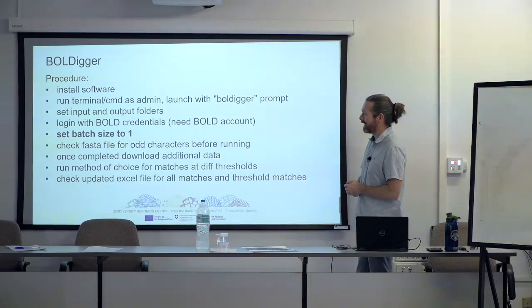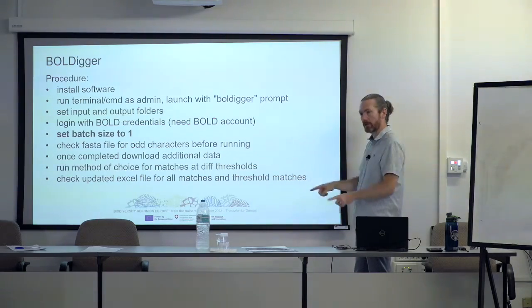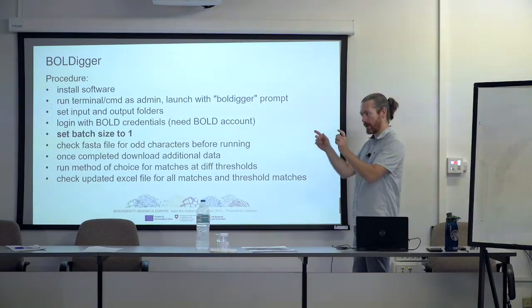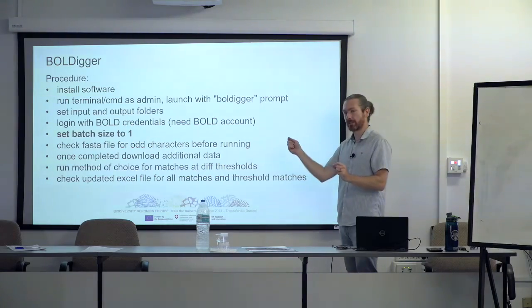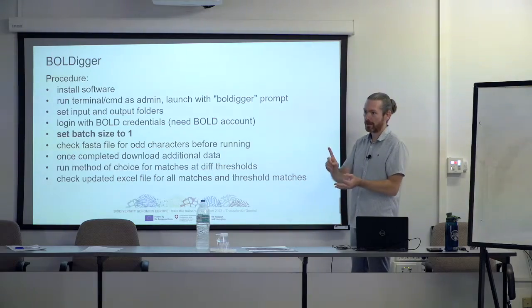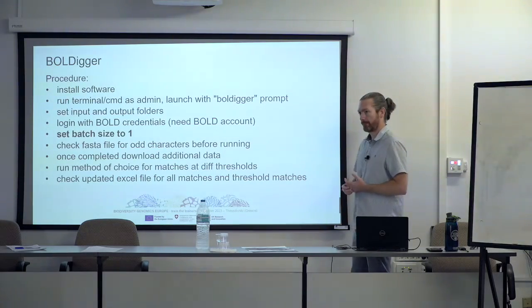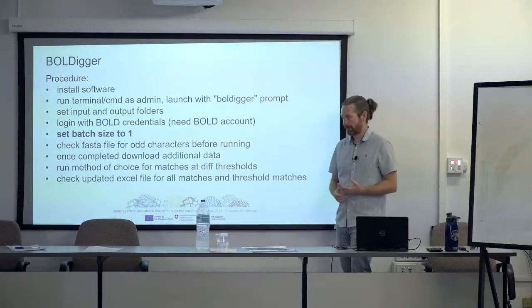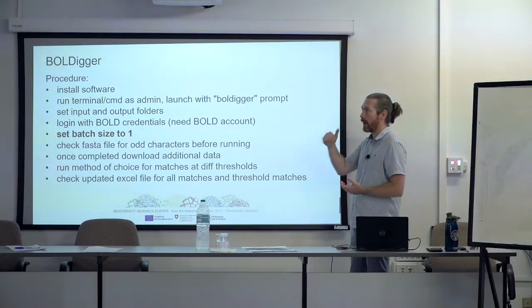And then the cool thing is it can download the additional data from Bold, so the stuff that you don't even see on the Bold web page. It now has every single record that it matched in the top 20, and then it goes back to Bold and downloads the original data of who identified it, how they identified it, a link to the record, and all those sorts of things for you. And guesses the top hit as well. Yeah.